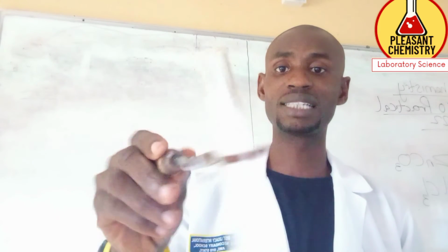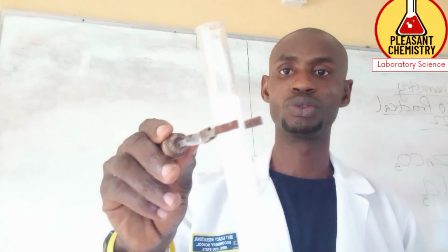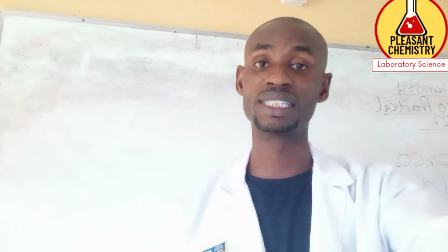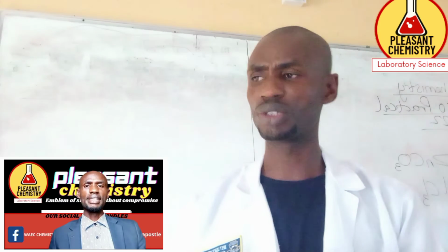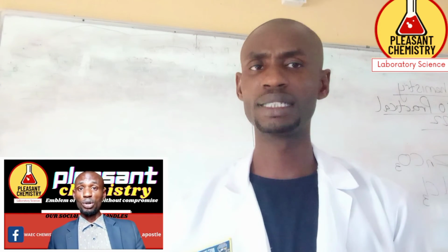The white gelatinous precipitate dissolves. That shows that either Zn2+ or aluminium, Al3+, is present. Both zinc and aluminium ions give the same test with sodium hydroxide. I will also drop the link to distinguish between Zn2+ and Al3+.